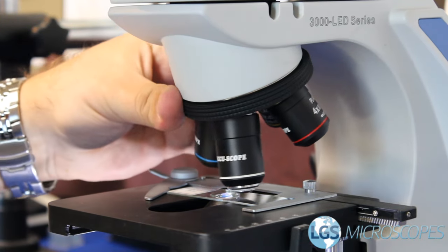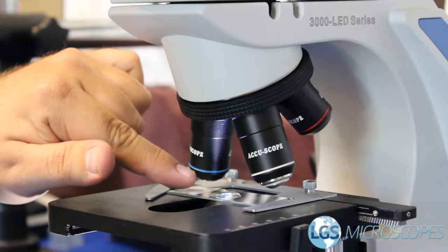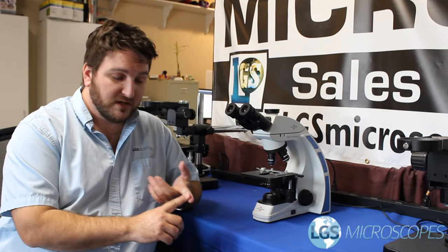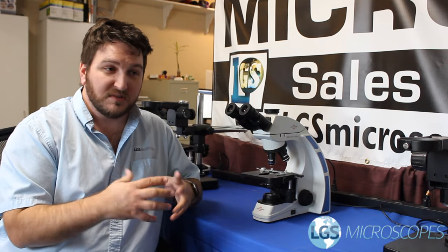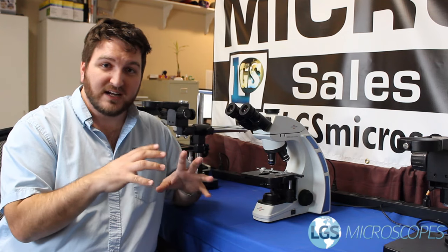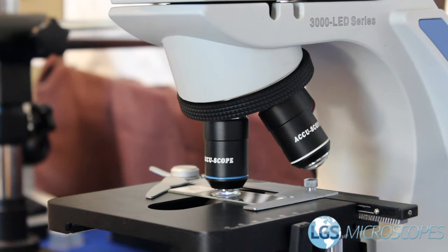Now a 40x objective is not sealed properly to keep out the oil and just like any other kind of oil, it always just gets where you don't want it to be. It works its way into all these cracks and crevices and it does the same thing inside of an objective. If oil ever gets inside of an objective it's almost impossible to remove it.